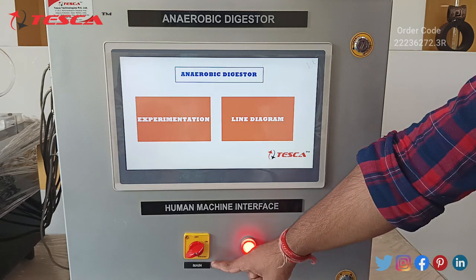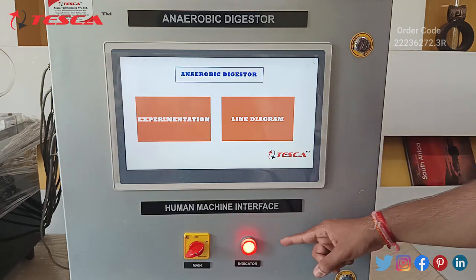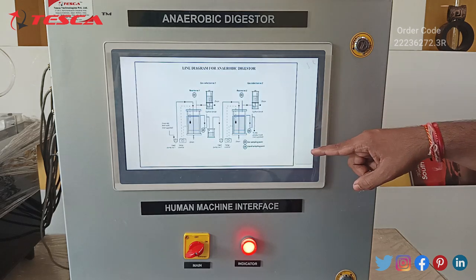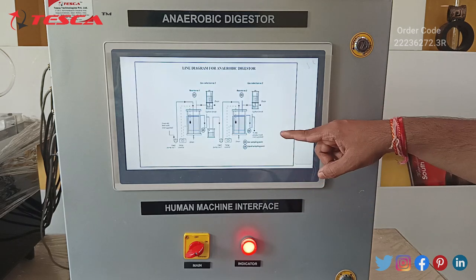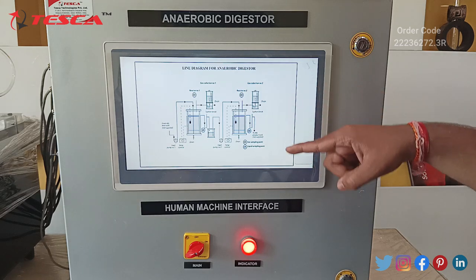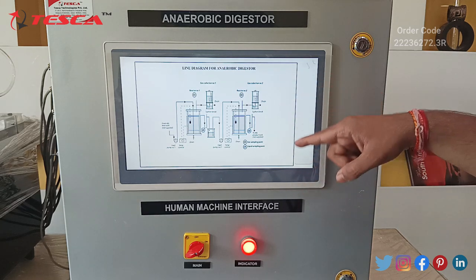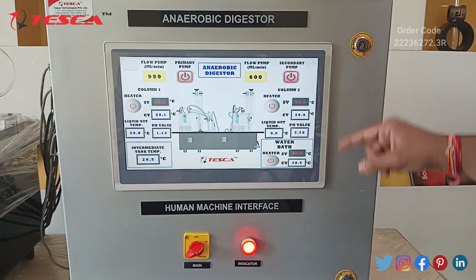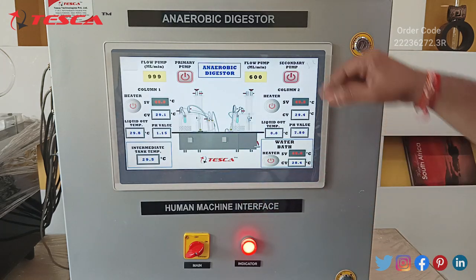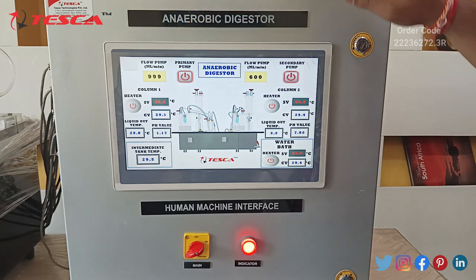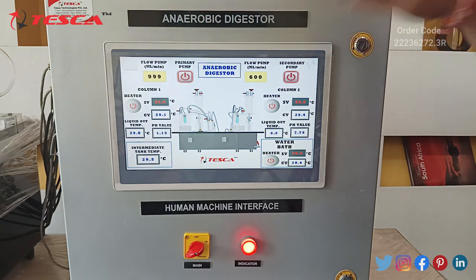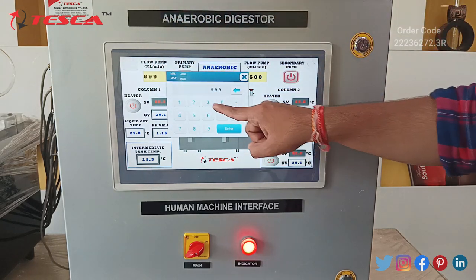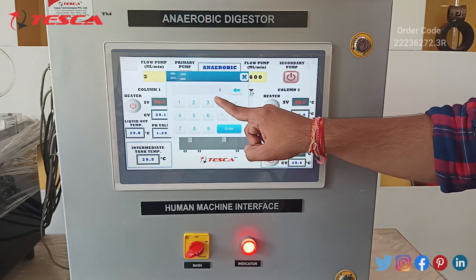Here we have our main switch and here is the LED indicator for it. As you can see on the screen, this tab is for the line diagram, which shows the connections of pipes and columns in our working unit. For the experimentation tab we have our whole control unit — this is the switch for the primary pump, here we have the switch for the secondary pump, and from this we can control the flow rate of our primary pump.